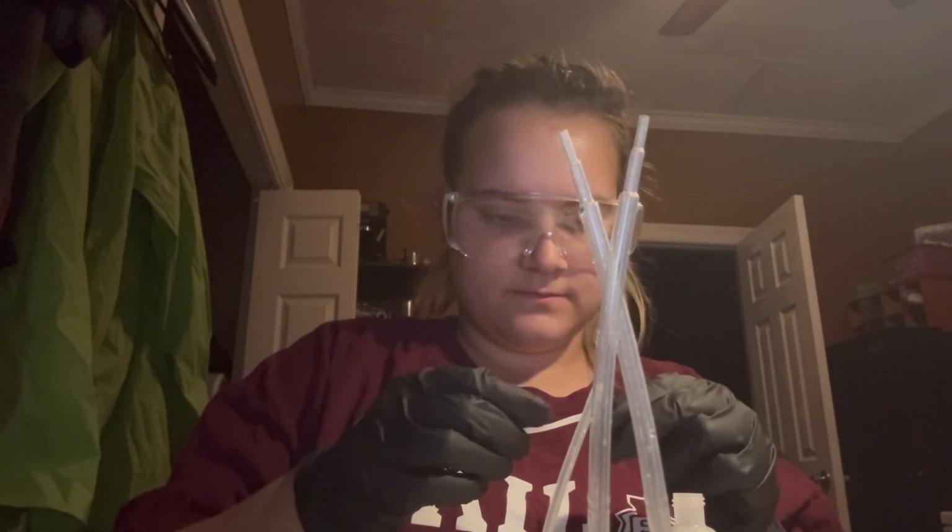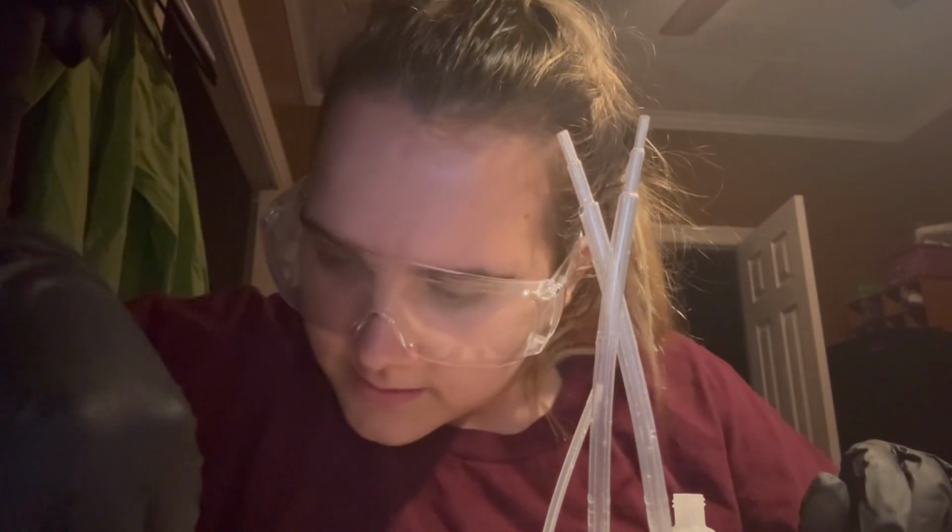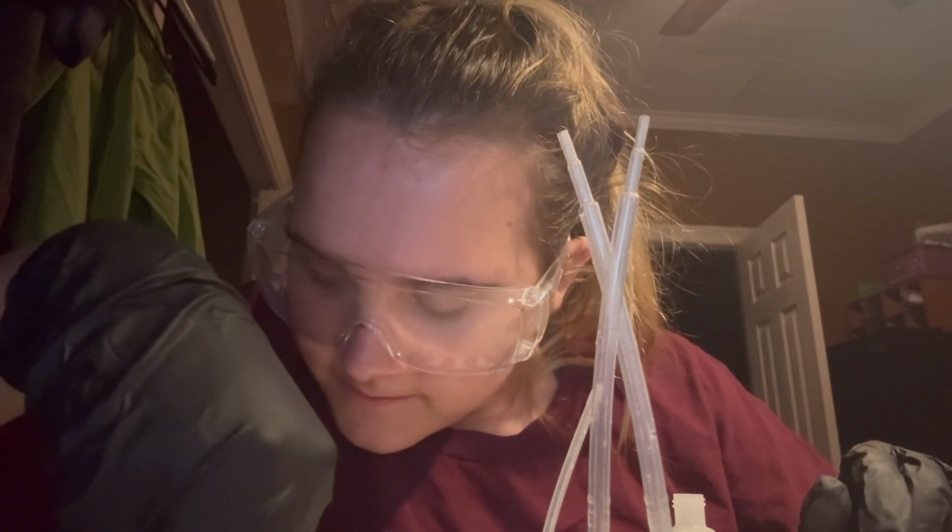Okay. So this came out as around 7, which is neutral for a solution. So the pH of water is 7. So now we use a short stem pipette labeled well D1 to add 2 drops of 0.1 molar hydrochloric acid from well D1 into the distilled water in well C1.